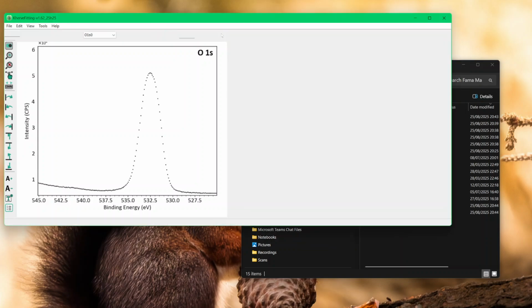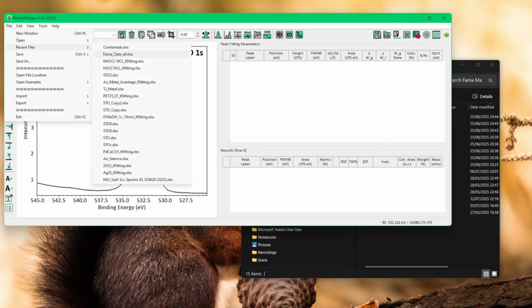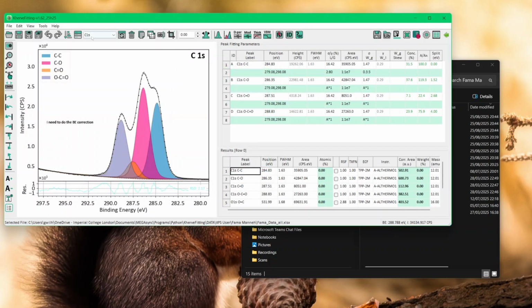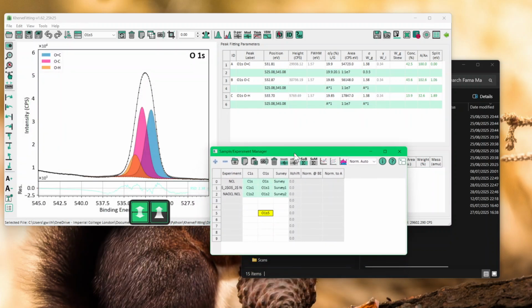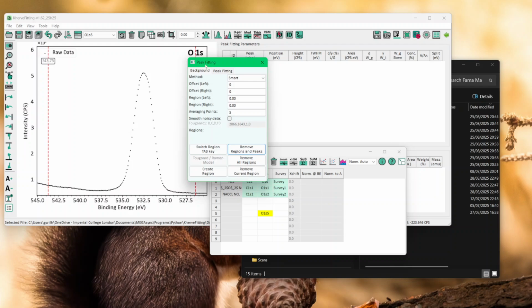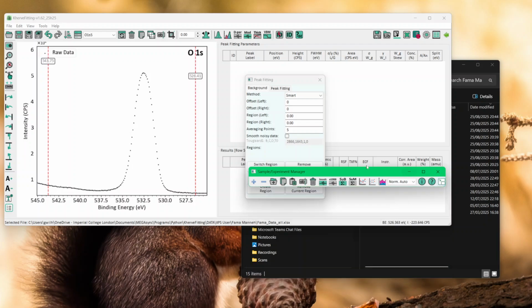Now, obviously, KherveFitting allows you to fit the data. And I will show you as an example, for example, on oxygen. So here we have data which was fitted before. I can remove absolutely everything. So now, let me just minimize this window.